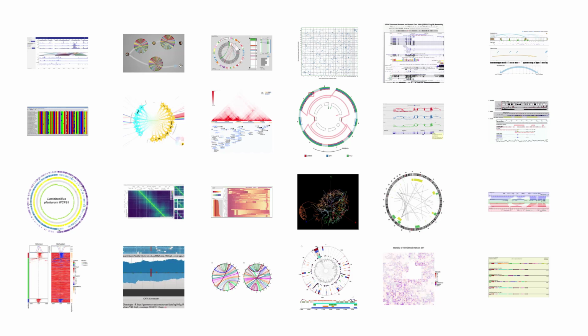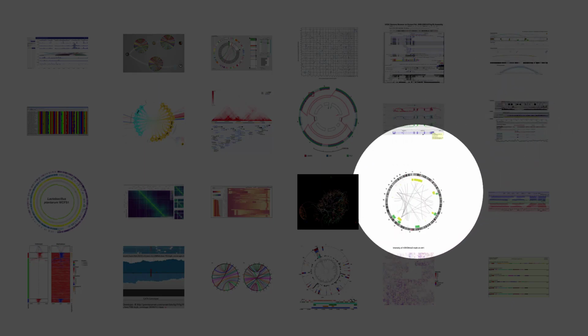And I'm pretty sure you recognize a couple of these visualizations in here. Who recognizes one visualization? Who has maybe played around with any of these? Do you recognize one? Okay. So which one? The TAD plot. Okay. Here, the top row, second from the right, is IGV genome browser. Yeah, that's a genome browser. It's not IGV, it's the UCSC genome browser. Yeah. I think we have IGV on here as well.